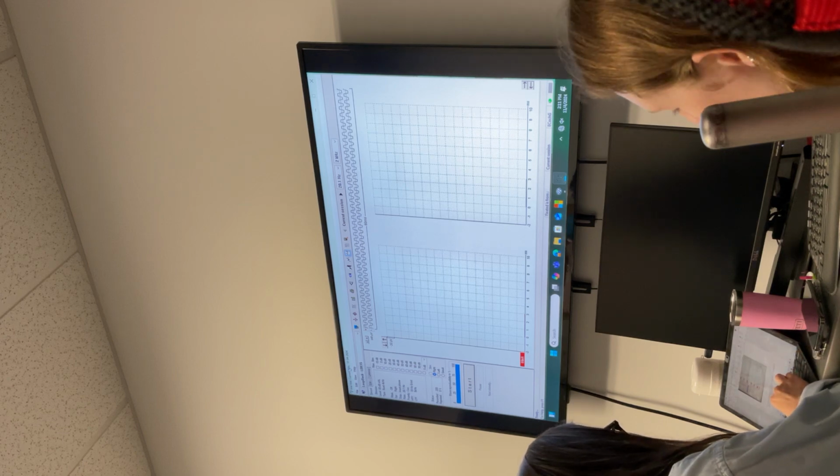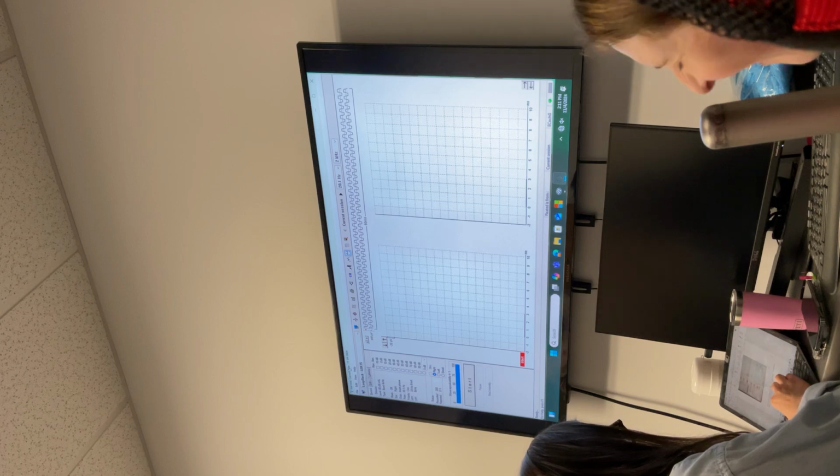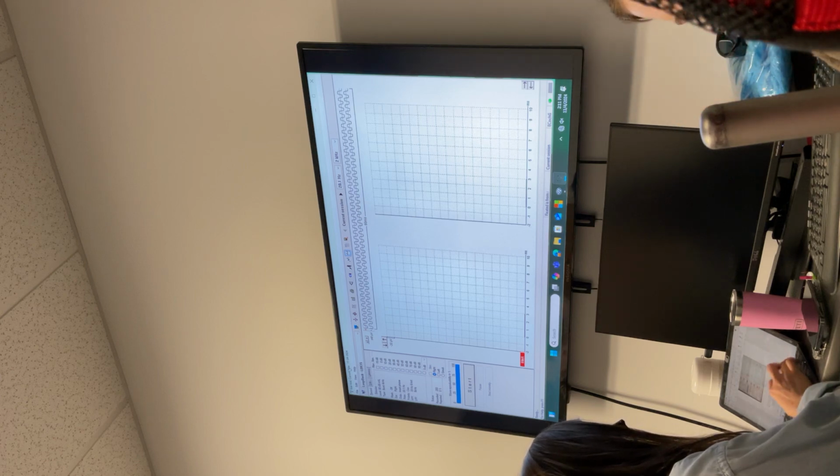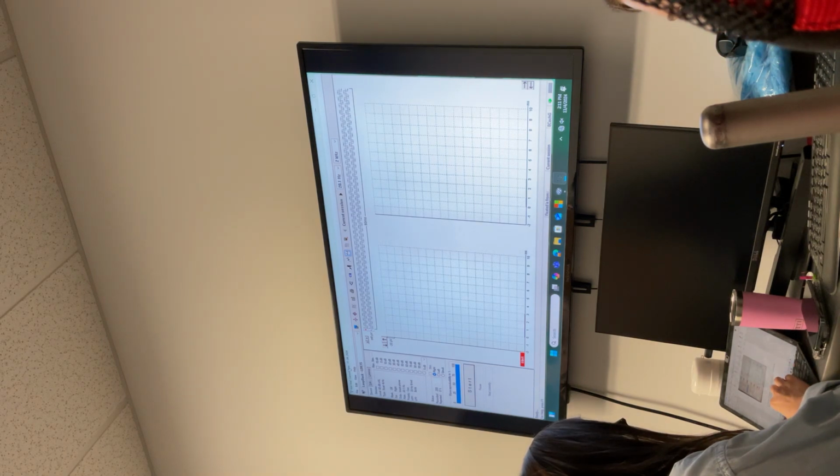Do you go down by 10, or could you skip from 70 to 30? Yeah, after that it all depends on how big the amplitude is. First you go down to 30. And if 30 is still big, then you can go to 10.